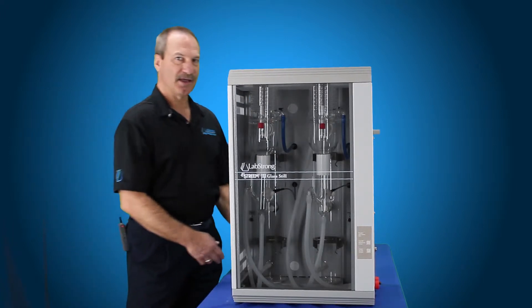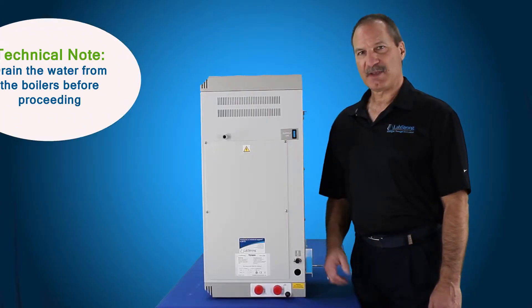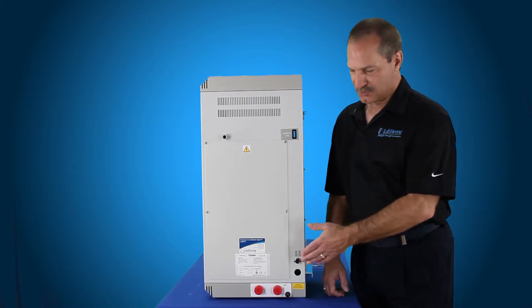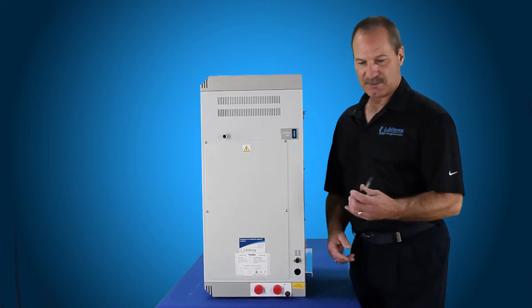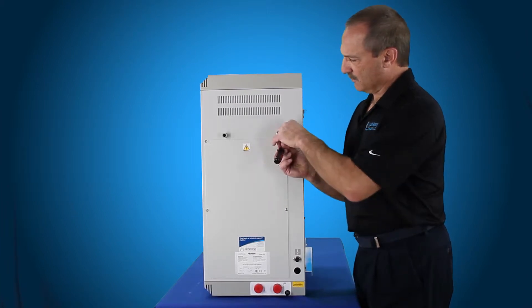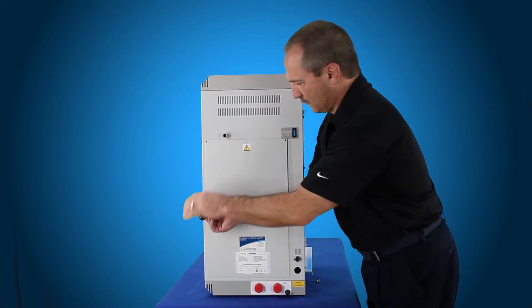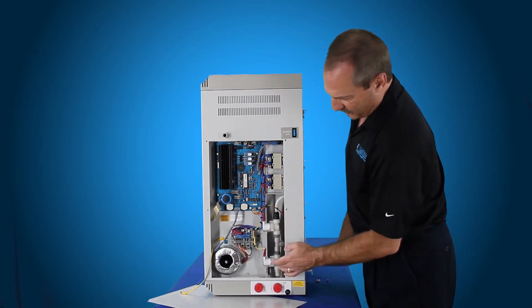Today we're going to show you what that assembly looks like. We're going to remove the right side panel on the FiStream 8 liter per hour system. This is the same panel for the 4 liter bi-distiller and also the 4 liter FiStream 3 system. Make sure your power is disconnected and your water shut off to the system. Then use a Phillips screwdriver to remove the four screws on the right side panel. This will allow access to the inlet solenoid valve assembly right here.